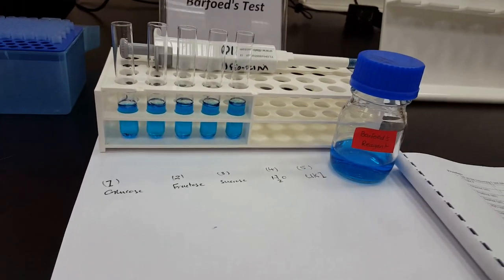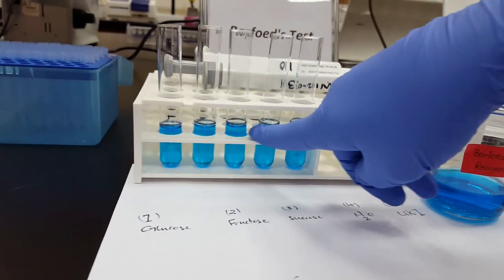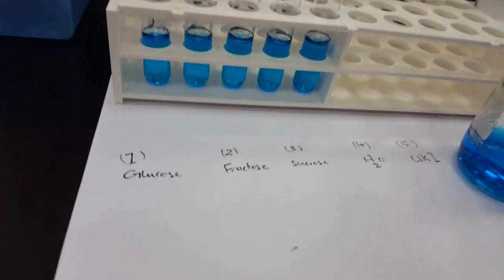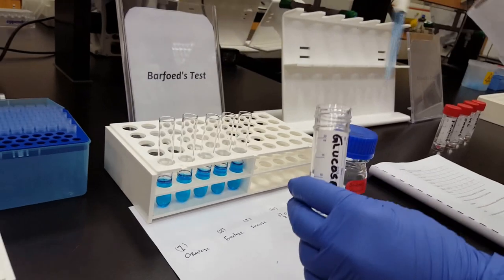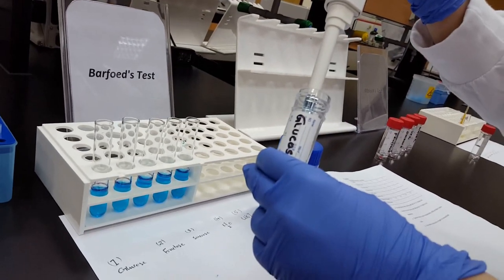Okay. How to do this test? We started by adding the reagent, 5 mL, to all test tubes, from 1 till 5. So it's already marked here. Then we have to start adding the different carbohydrates. So we have here the glucose. I add 1 ml of glucose to the first test tube. It's already set at 1,000 microliter, so this means it's 1 ml.